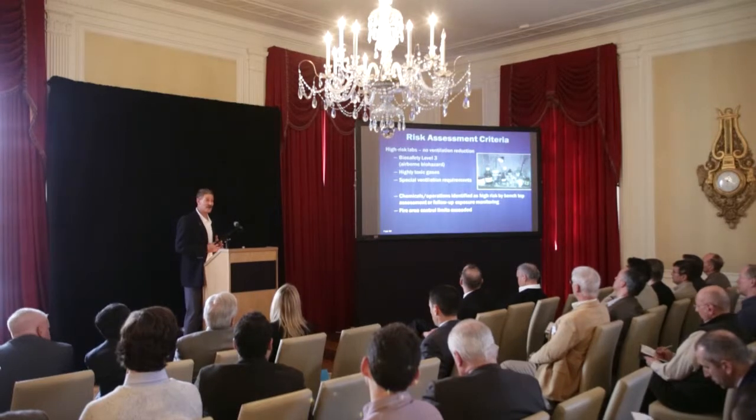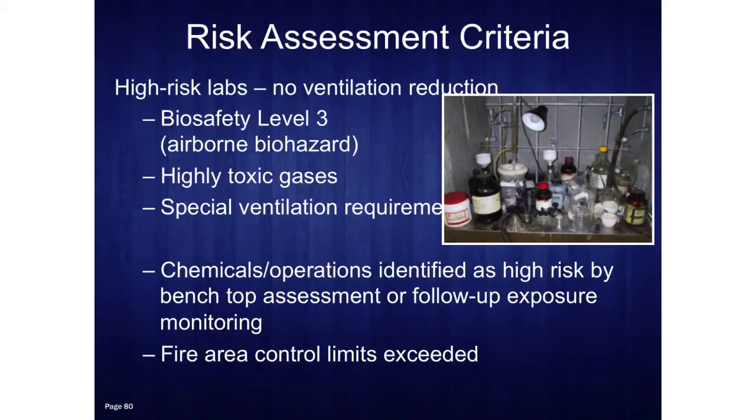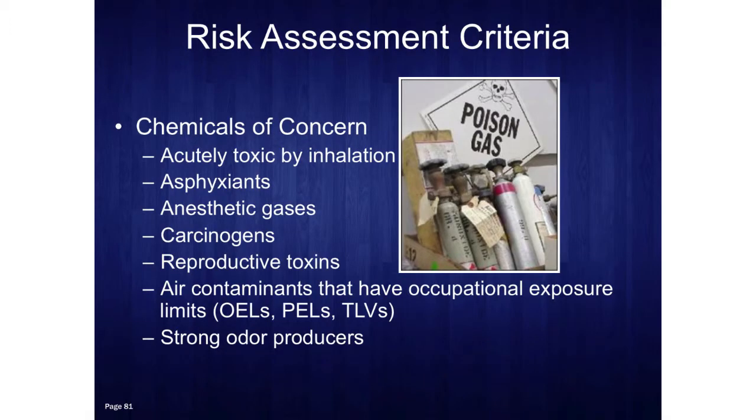In high-risk labs, for example, biosafety level 3 labs, labs with special ventilation requirements, no air change reduction. Our risk assessment looks at all of the chemicals of concern. We've listed some of the chemical families here for you.